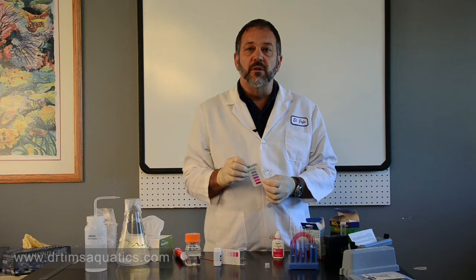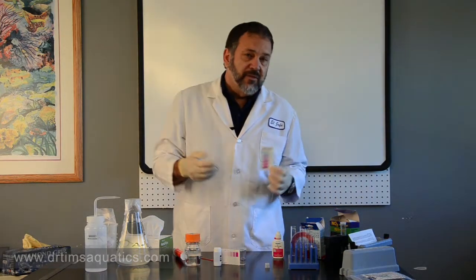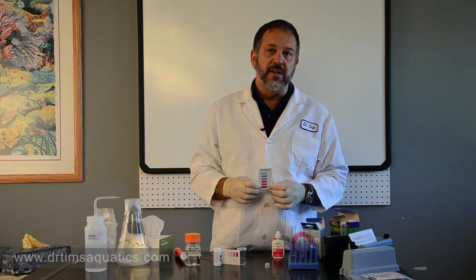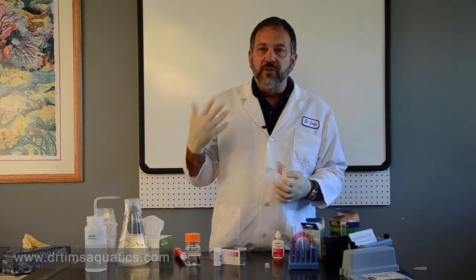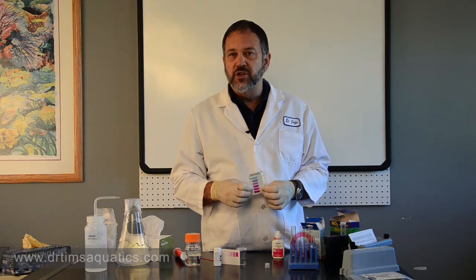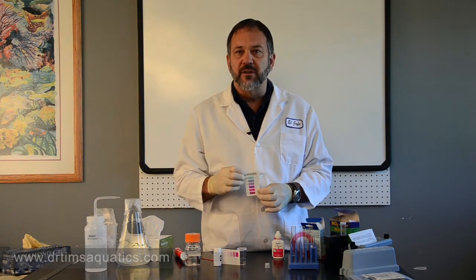You have to make sure that your test is in range — whatever you're measuring has to be within the range of the color chart. If it's way over the color chart, as this sample is, you're going to get a false zero reading. To fix that, you have to do dilutions, and that's why you should have some distilled water nearby. When would this be the case? If you set up a brand new aquarium and haven't used nitrifying bacteria, you can expect to see high nitrite. You've also got to think about the situation — if you've had a fish die off, a catastrophe, or it's a brand new tank, do some dilutions to get the water sample down into the range that the test kits can measure.